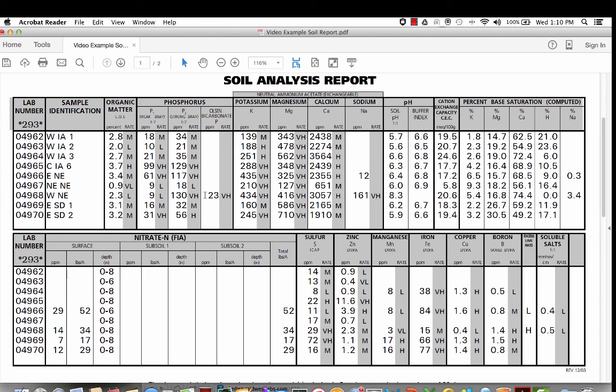So in this case, with that high pH soil, we went ahead and ran the Olsen bicarbonate test, and that Olsen showed us that there was quite a bit of fertility there that wasn't being shown in the P1 Bray, and we come up with an Olsen value of 23, which is quite high.